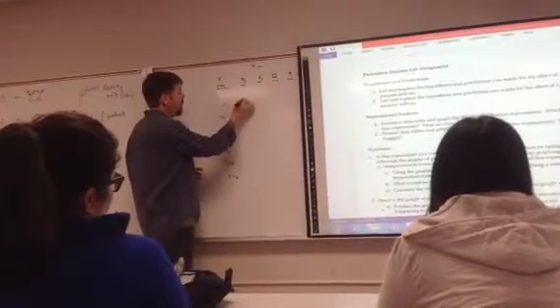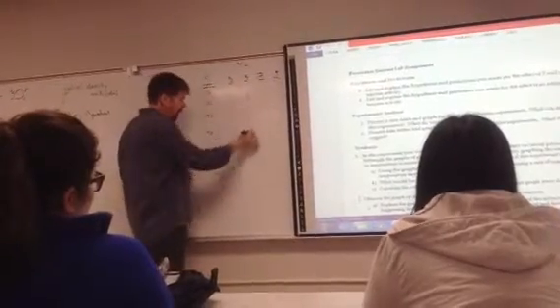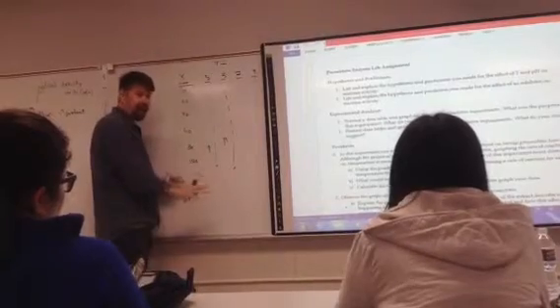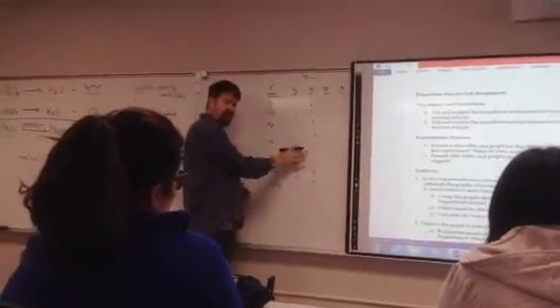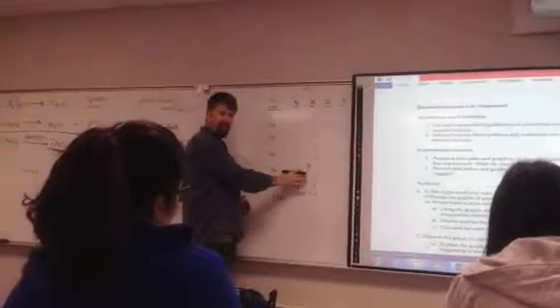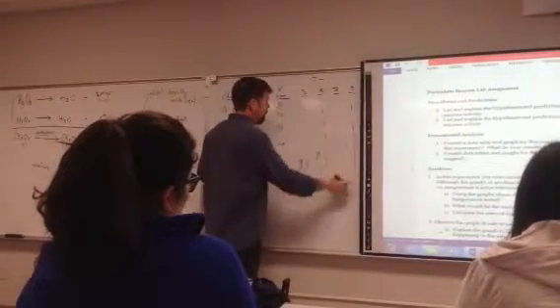And basically what you should see happening is an increase in absorbance in all of these, right, as time proceeds, unless you got none to start with, which could be under extremes. Maybe you fully denature the enzyme and you never get any of the reaction proceeding. So these might all be zeros or stay relatively low. But essentially, you're going to get this data table.